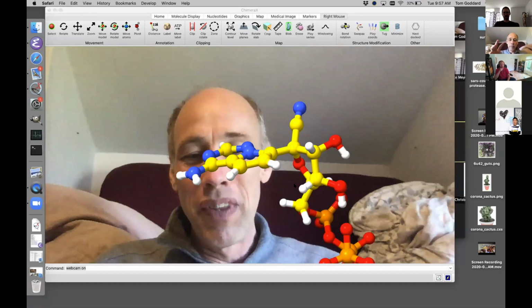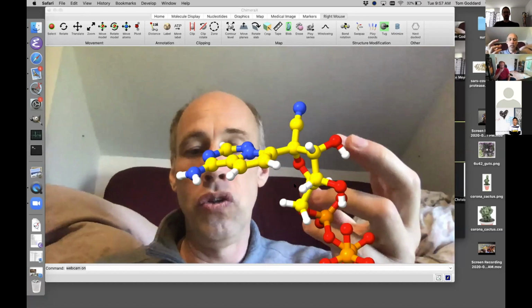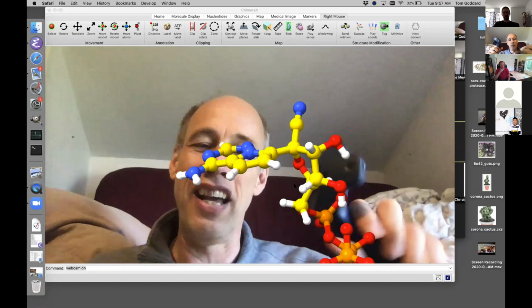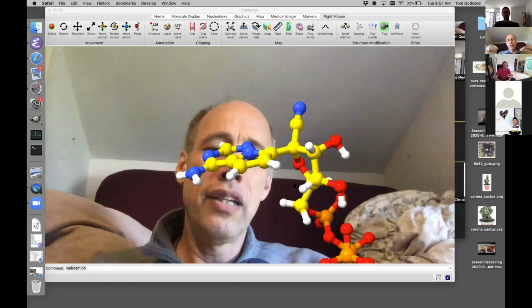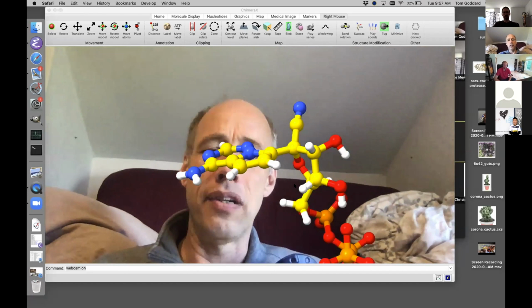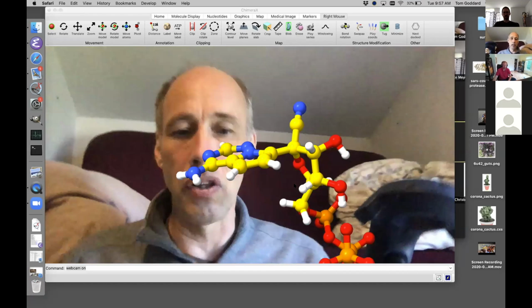So hand tracking can be a much more natural way to do things. And I was considering, maybe I can use the VR hand controller without the headset. But in all of those things, what I'm most concerned about is people don't have that specialized equipment. And that limits the use a lot.